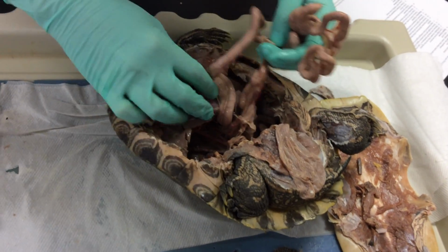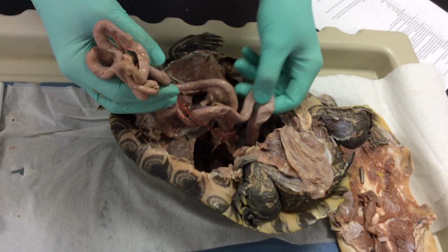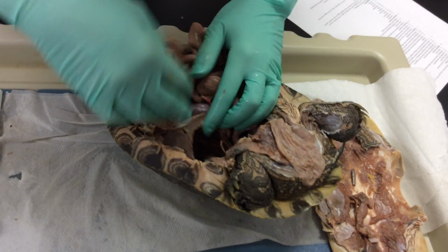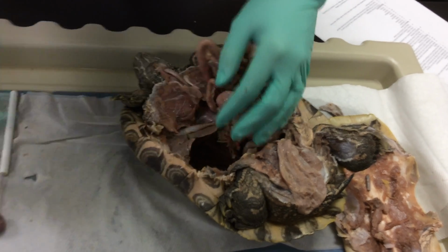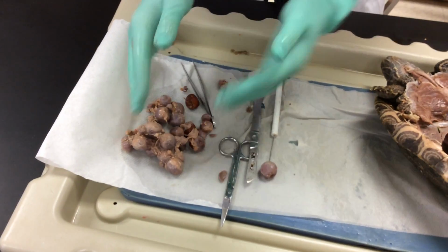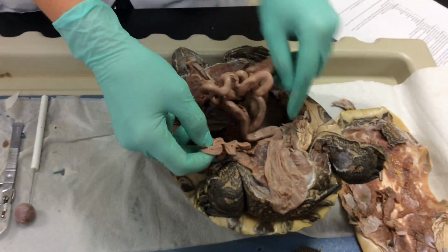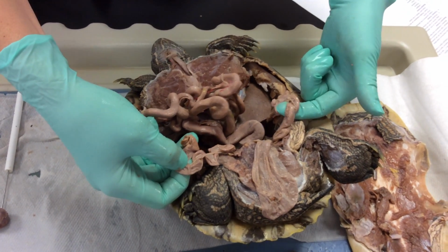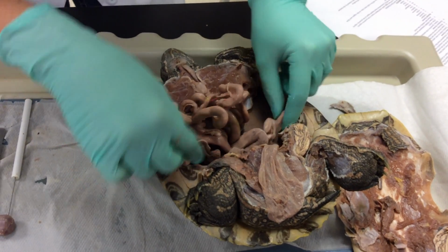So on the small intestines, you're going to find a spleen, which kind of looks like it's absent. Maybe we'll find it in just a second. But we have these things right here. And you can see all of these. These are eggs. And the eggs are part of the ovaries and the oviduct, which is this reproductive system right here. So they're producing gametes in order for the species to continue on.